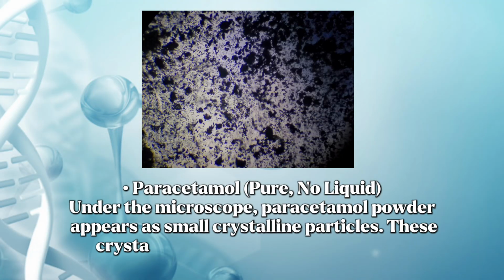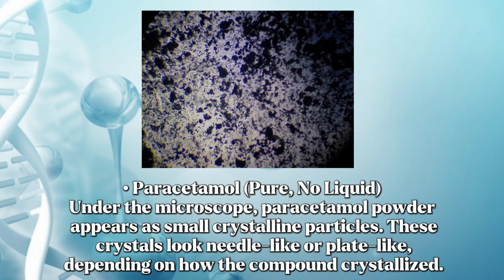Paracetamol. Under the microscope, paracetamol powder appears as small crystalline particles. These crystals may look needle-like or plate-like depending on how the compound crystallized.